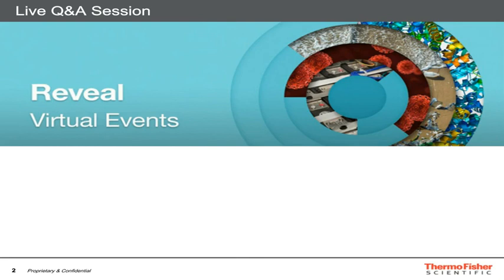Sure thing. This is Matthew. So this particular implementation, the combination of XPS and Raman, uses a relatively low power magnification objective to do the Raman sampling. I don't know the exact number off the top of my head, but this would be in and around the range of 10 micrometers or greater. It's certainly going to be much larger depth of penetration and depth of measurement than the XPS component.